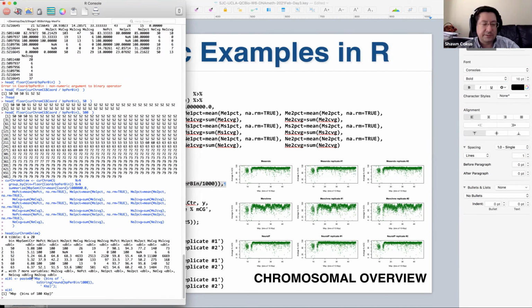So we use paste0 to construct a string: megabase pairs, bins of, take base pairs per bin, divide by 1,000, that gives us KB, round it, we don't really need decimals. It won't be super precise, but you're not going to make a bin size that's not a multiple of KB. Whatever, it's suggestive, not exact. We round it to an integer just to make sure it's an integer, convert it to a string so that we can paste0 it up, and then KBP, done, whatever.